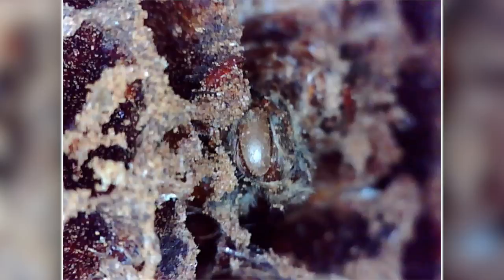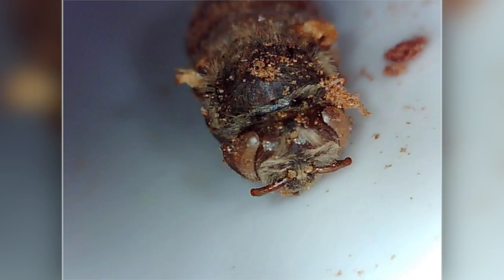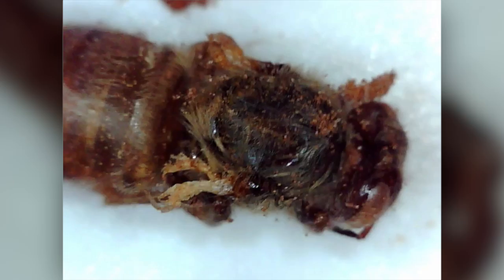Because she looks pretty fully developed, I've got some tweezers here so I'm going to take her out of the cell so we can see in close-up what an adult bee looks like. Looking at this girl under the microscope, she is incredible. We can really clearly see her enormous eyes, her little antennae, her legs, and her abdomen. What's blowing my mind is just how hairy she is, and the reason honeybees are hairy is that those little hairs help to trap pollen, which they pick up as they fly from flower to flower in search of nectar — really important for pollination.